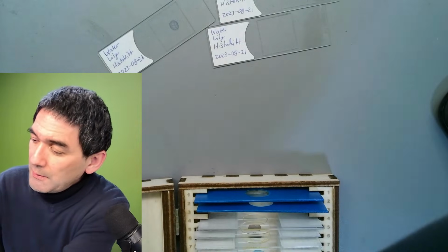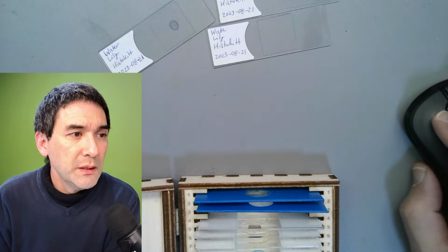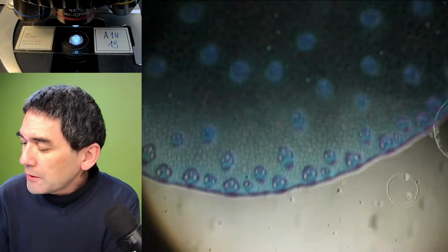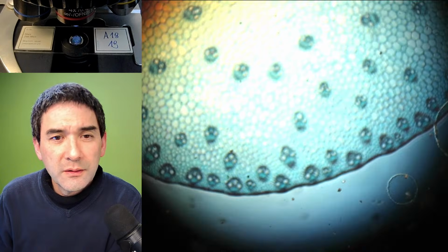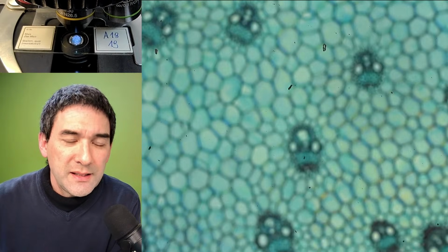This is maize, basically corn. The cross section. Let me go back to the normal one, and I need to refocus a little bit. That's a typical structure of a monocot plant.